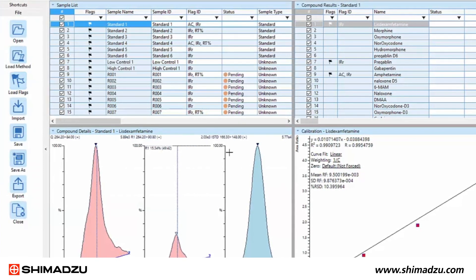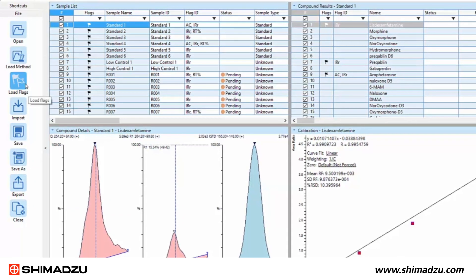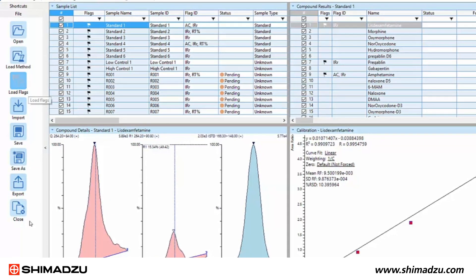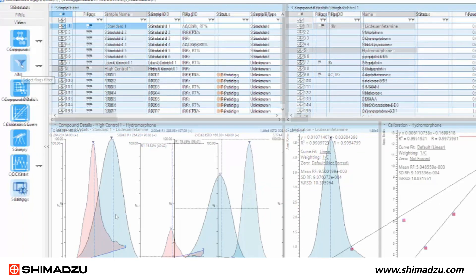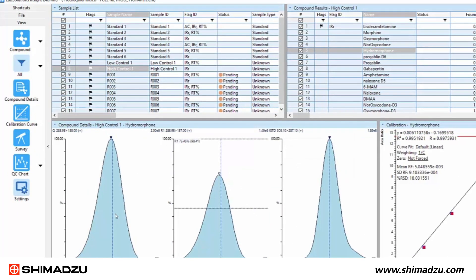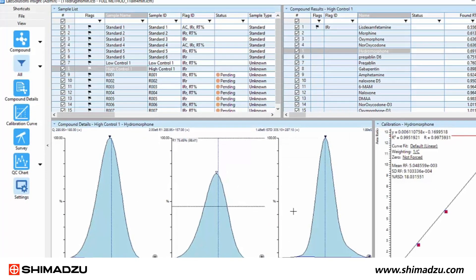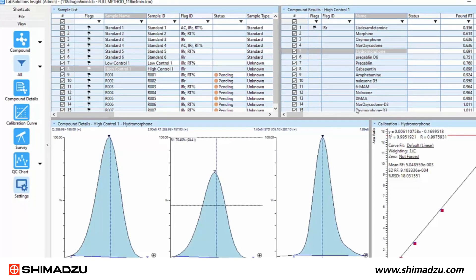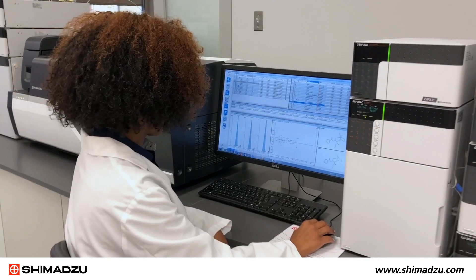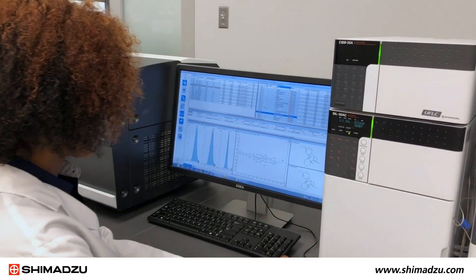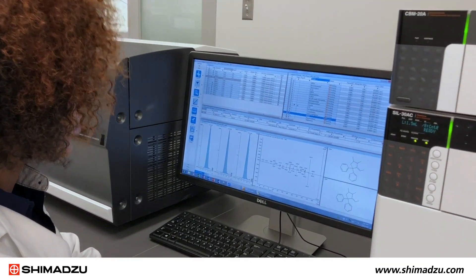Insight contains over 90 QA-QC flagging criteria for retention times, reference ion ratios, concentration limits, and more. The software automatically applies your chosen criteria to data and flags any deviations, enabling you to immediately identify and analyze them. Instead of looking at hundreds of chromatograms, you only need to focus on the chromatograms that require your attention.